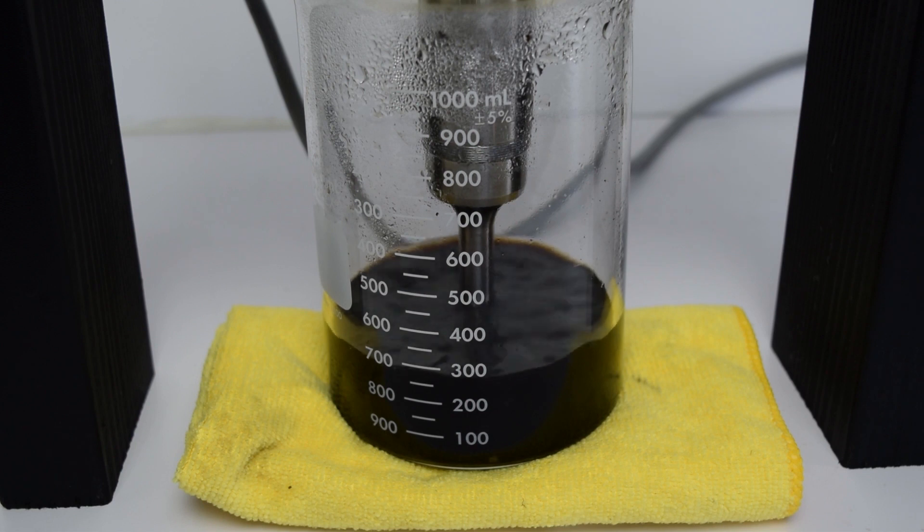The first step after mixing graphite oxide in deionized water is to ultrasonicate the mixture for about 45 minutes to create graphene oxide. You can use an ultrasonic cleaner bath but it will take longer. You will want to do this in 10 minute steps so the solution doesn't heat up and start the reduction.